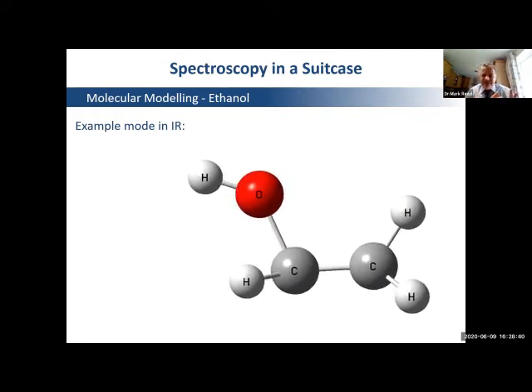Okay, so we've seen the infrared in action, we've run a liquid sample, we've seen our spectrum, and we've looked at some of the vibrational modes that cause those peaks to exist. It shows you how the energy is being absorbed. I mentioned at the beginning that we can also analyze solid samples as well. And the procedure is almost exactly the same.